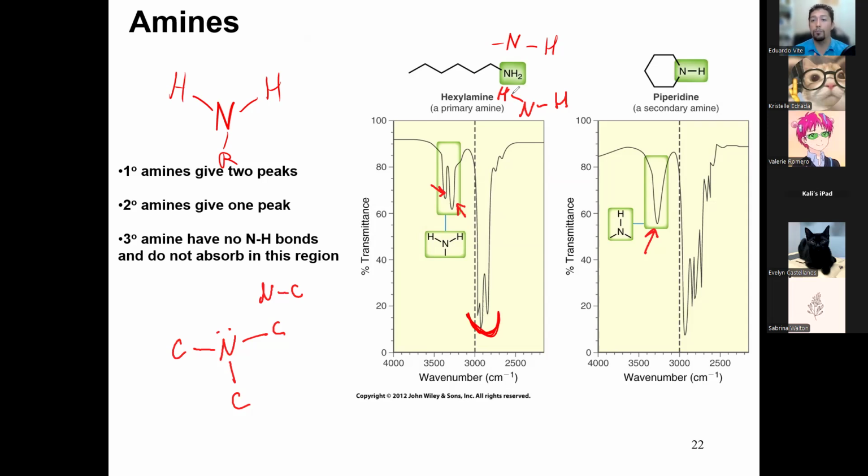The way you might have, like, N2H5, and maybe sometimes one of the nitrogens has two, and in the other isomer, there's only one NH. So yeah, you would have different signals. Yes, you know that it's an amine based on the fact that it is a weak peak just to the left of the alkane peaks, and you either see one or two.